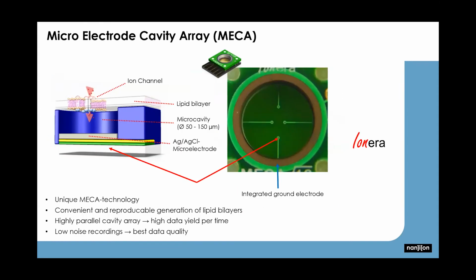And what does the recording substrate actually look like? Well, we use the microelectrode cavity array chips, so-called MECA chips.